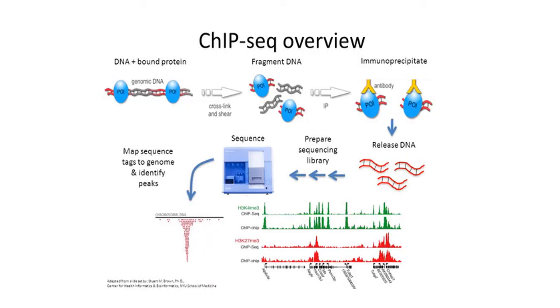Okay, so with ChIP-seq, at the end, you will get sequencing data that will tell you what pieces of DNA you acquired through this process, and where they were located in the genome. So here's where you have to get your sequence information and align it to the genome, and you get little peaks where each time the software sees a piece of DNA that matches that, it aligns it, it puts it where it's supposed to be, and ultimately you get a bunch of little tick marks across the genome at the locations where the DNA was pulled down by virtue of binding to that particular antibody.